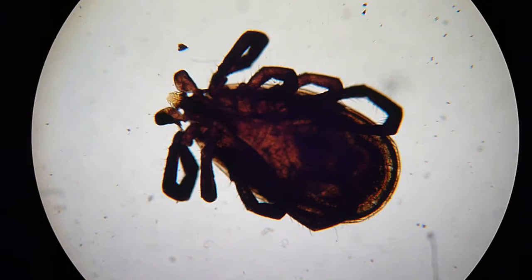May I present the tick. It is a tick. Eight legs, very clear, the shape all of them as well. That is basically how it looks like on bright field using my 4x objective. I'm going to now increase the magnification a bit.